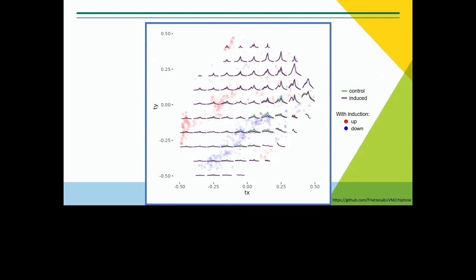One thing, if I was analyzing this data, while analyzing this data, one thing that would pop out to me is that a lot of these differential regions are in the lower signal areas of the genome, and they're less likely to be biologically interesting. So unless there's a compelling reason to preserve them, I might think about going back and filtering my Seesaw differential call.